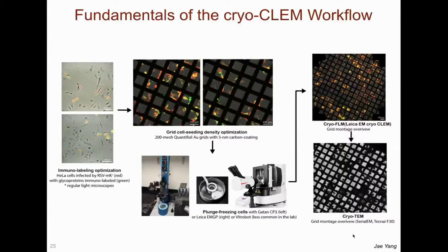Here, Jay demonstrates the steps of an improved workflow for correlation between the cryofluorescence microscope from the Leica Cryo-CLEM and the cryo-EM data from a 300 kV side entry microscope.